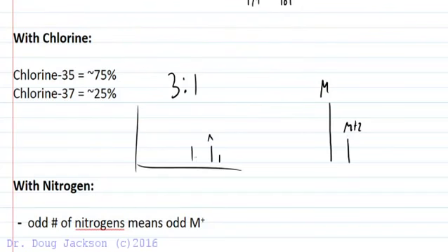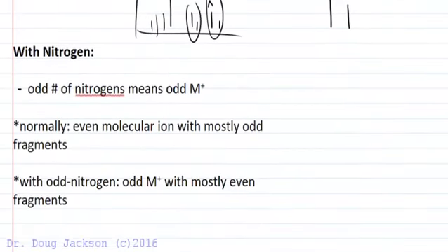You'll see a series of these types of peaks leading to an M-35, M-chlorine peak where the doublets stop in your spectrum. But you'll see these 3-to-1 doublets going down at M+2 when chlorine is present in your mass spec. Okay, and we'll see more examples of that in class as we go and in the book.